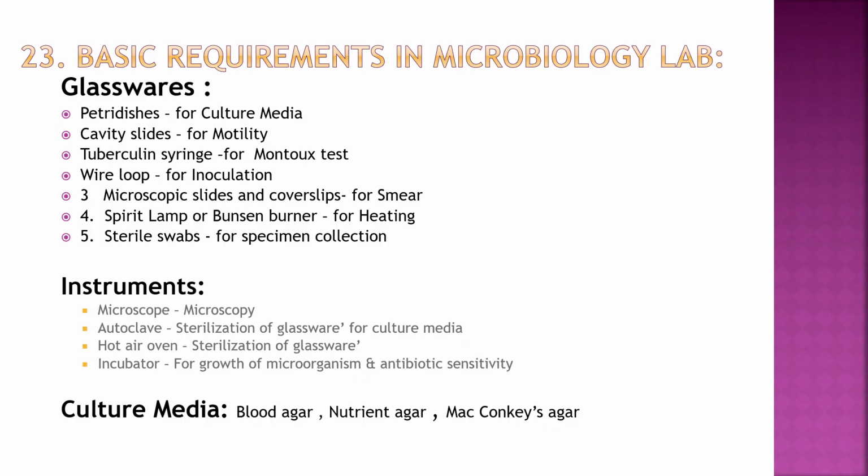Autoclave is used for sterilization of glasswares for culture media. Then hot air oven for sterilization of glasswares, and incubator for growth of microorganisms and antibiotic sensitivity testing. And culture media routinely like blood agar, nutrient agar, MacConkey agar, etc. are required. So these are the basic requirements in a microbiology laboratory. Thank you.